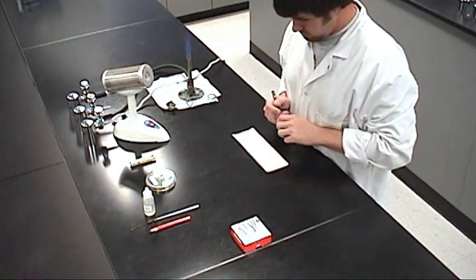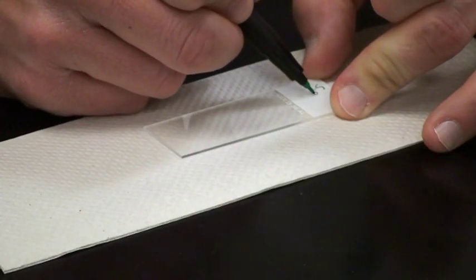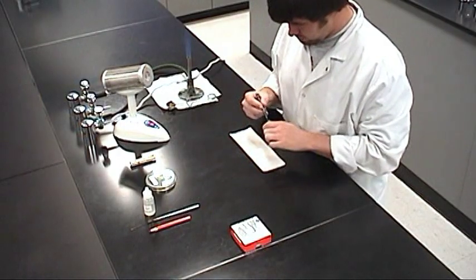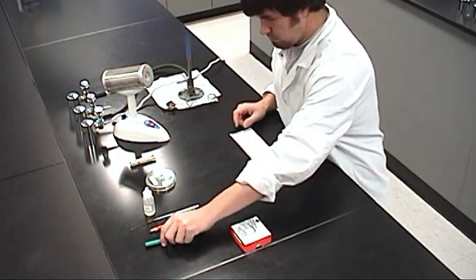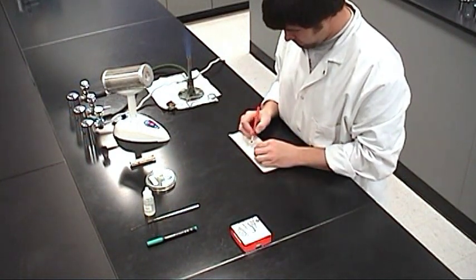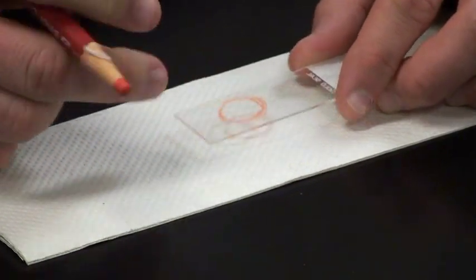Begin by using the permanent marker to write the name of the specimen on the frosted end of the slide. Using the china marker, make a target circle about the size of a dime on the underside of the slide, about two-thirds down away from the frosted end.